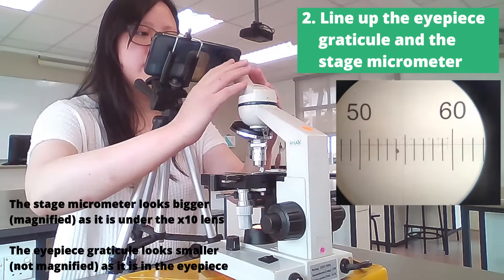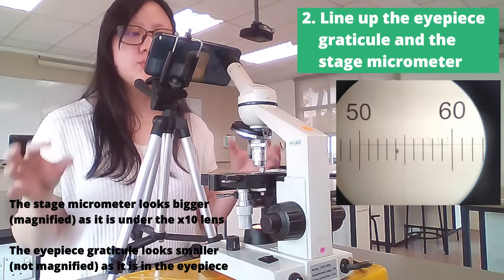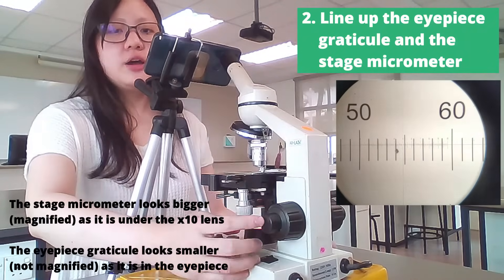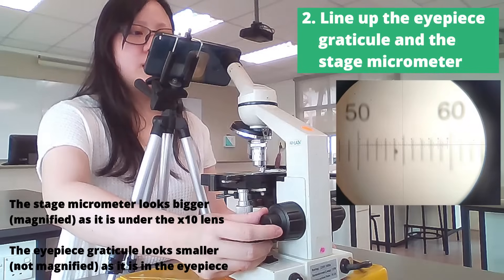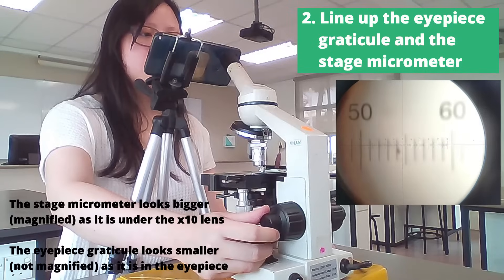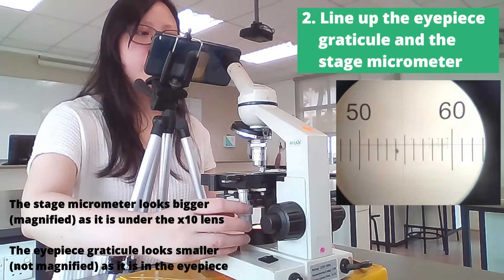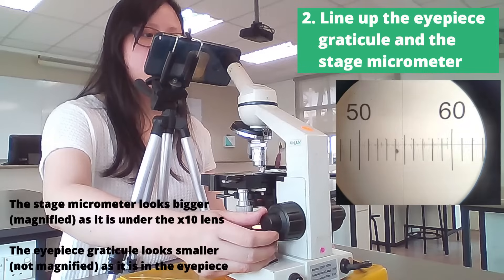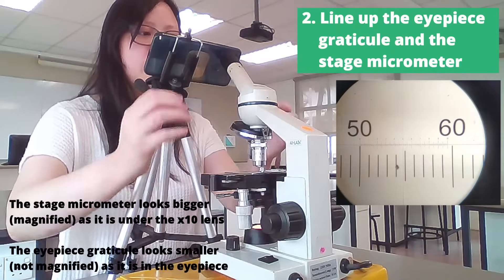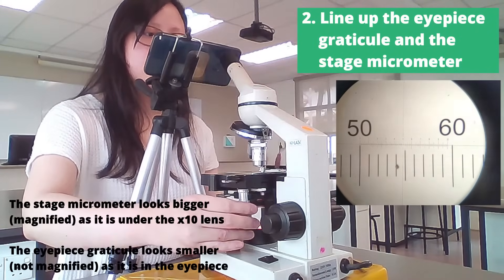Once you get there, you might realize that you cannot see the eyepiece graticule and stage micrometer at the same time — one might be blurred and one might be focused. What you can do is use the fine focus knob and gently pull it out of focus and back into focus again until you can see where both the eyepiece graticule and stage micrometer are, and ideally they are both in focus. I like to put the graticule on the outside a little bit — make sure it's parallel — and then read off.